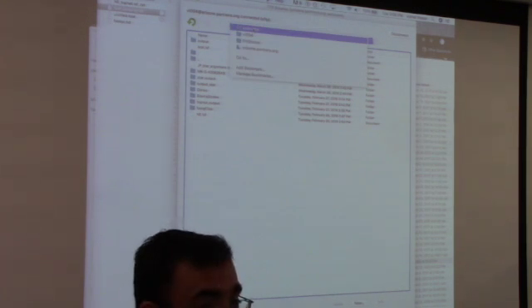Okay. All right. So people, we're going to connect to your Iris1 servers in our directory. I've actually put the path here, but you can connect to your home directory and then CD into Awesome. Everybody knows how to do that? Yeah, in FileZilla or TextWrangler or BBEdit. If you're using BBEdit, you can connect directly because we're going to edit an existing file. For the Windows users, you can download the file locally and then edit it.